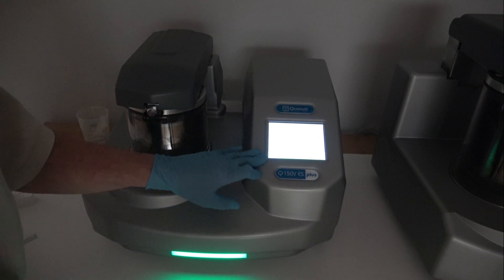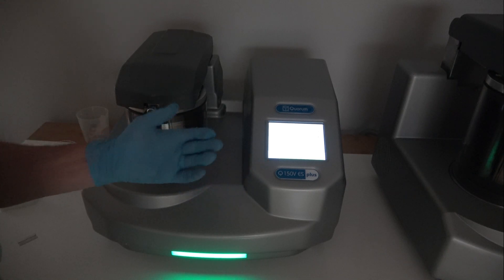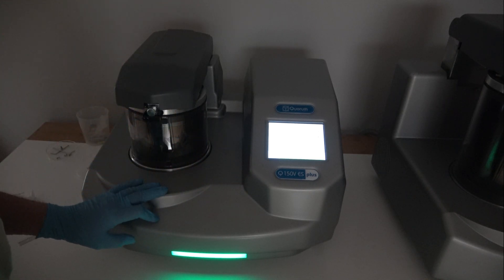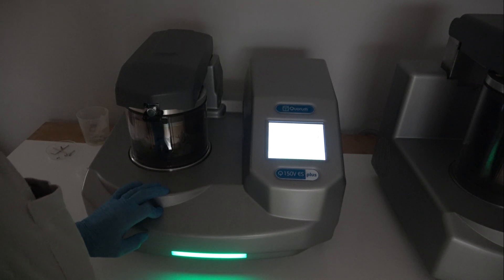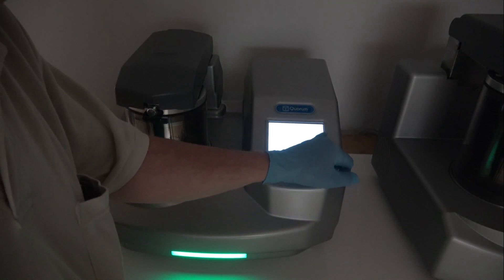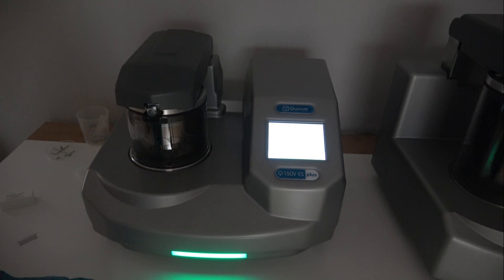This system is already in the mid 10⁻⁵ range in that short time, which is quite enough for a standard Q150T system. This happens to be a V-plus, which is capable of 10⁻⁶, but we're not going to wait that long. It says it's pumping down with a percent done — it's almost at 90 percent before it will let you actually run the process.